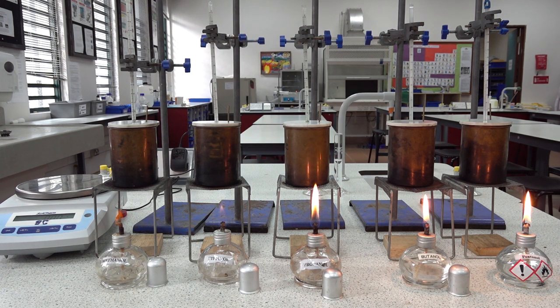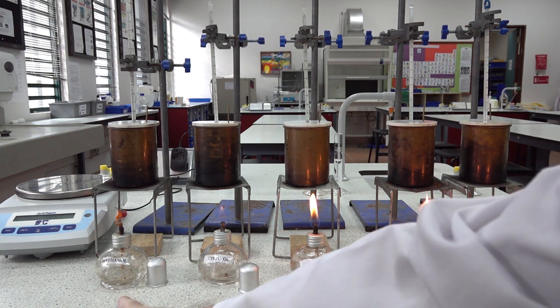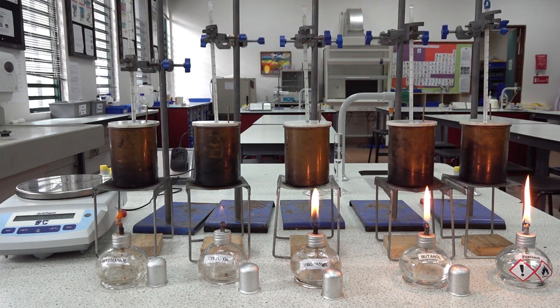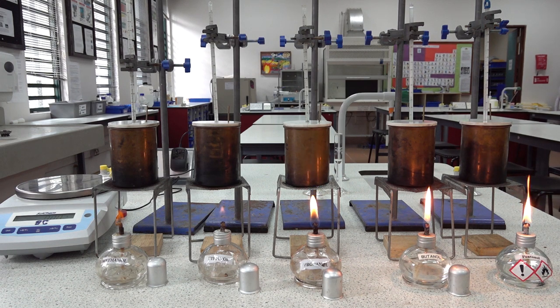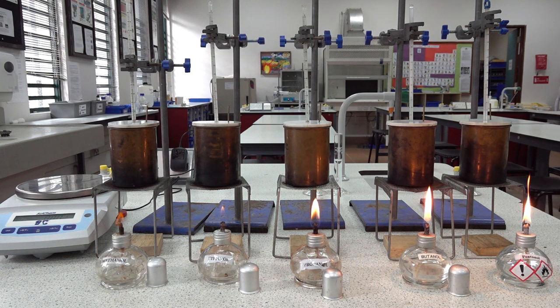The enthalpy of combustion of alcohols: in each of the five burners we've got an alcohol - methanol, ethanol, propanol, butanol, and pentanol. In each of the five copper calorimeters we have 120 centimeters cubed of water. What we need to do is record the mass of the alcohol burners before and after heating the water, and also the temperature rise on the thermometer.